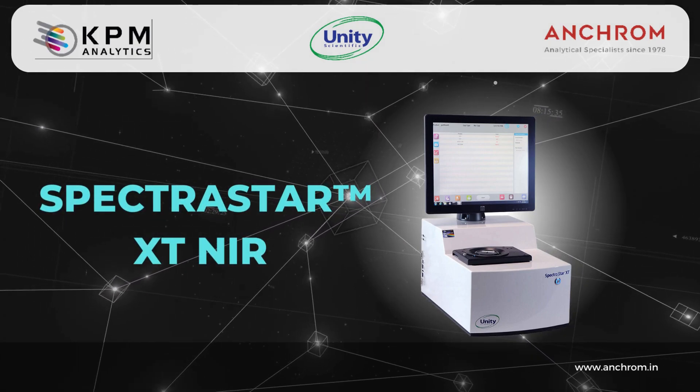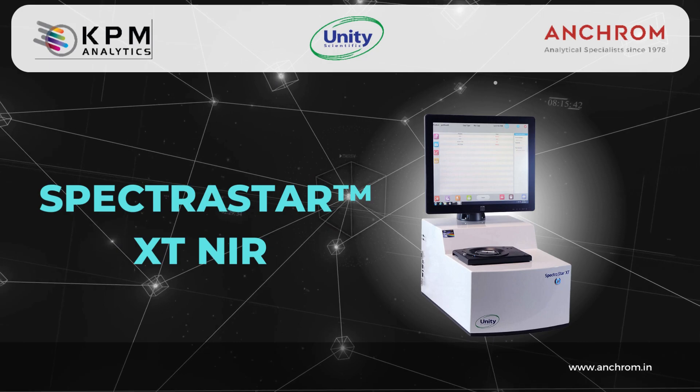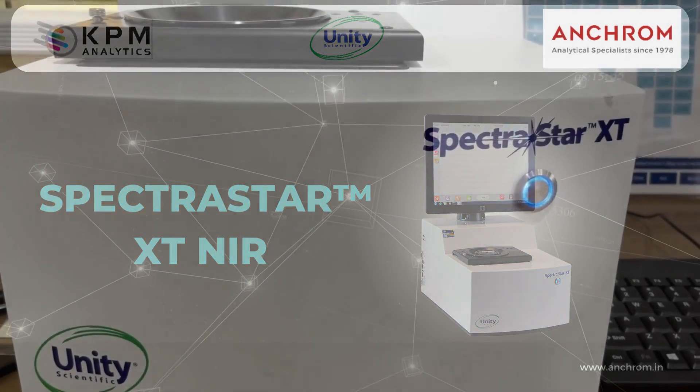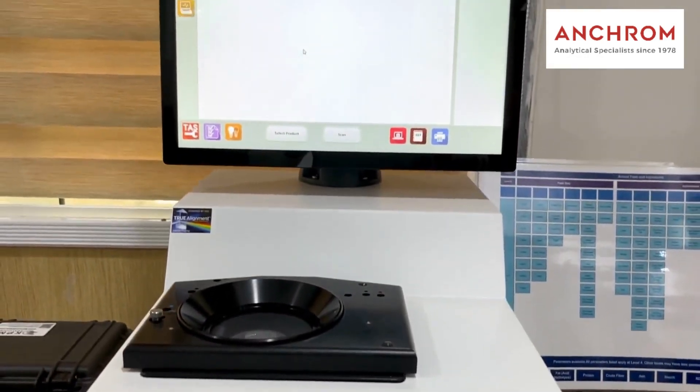Hi, we are from Ankram. Today, we are excited to introduce you to the Unity Scientific NIR SpectraStar, a powerful instrument for near-infrared analysis.